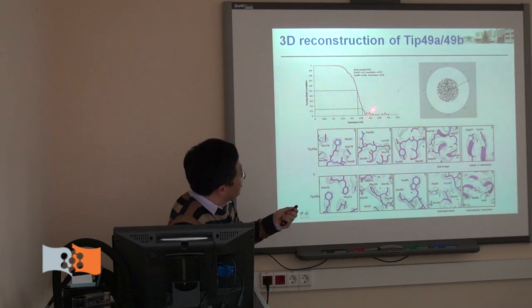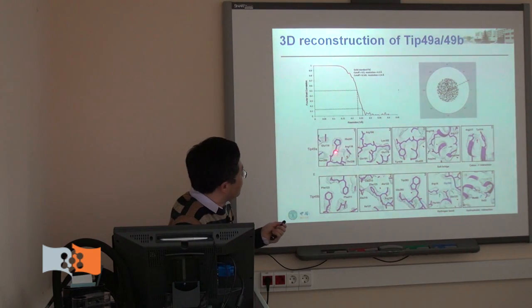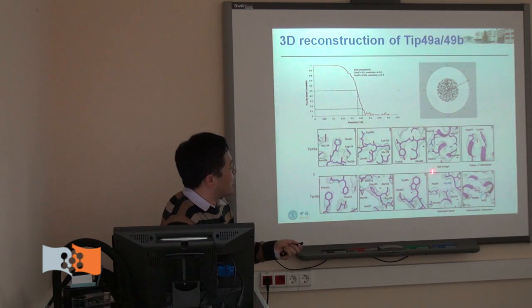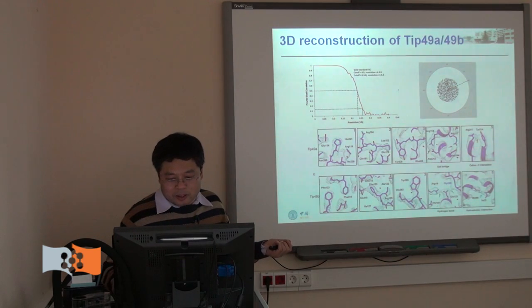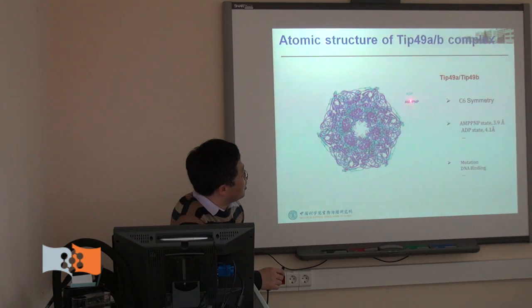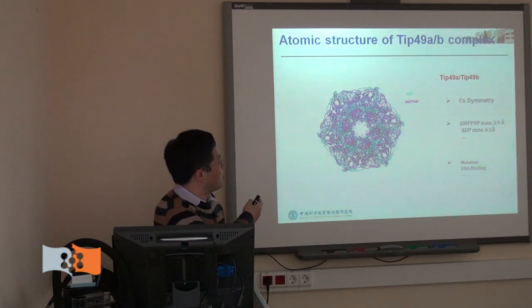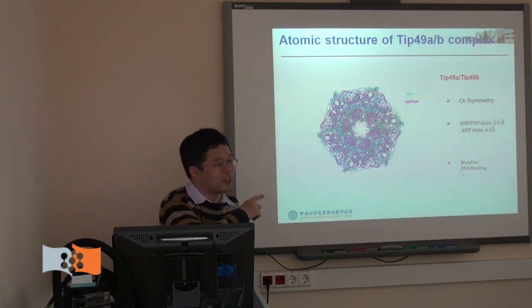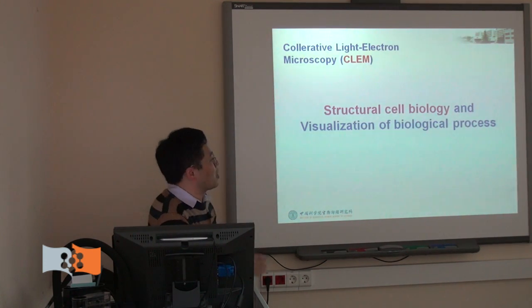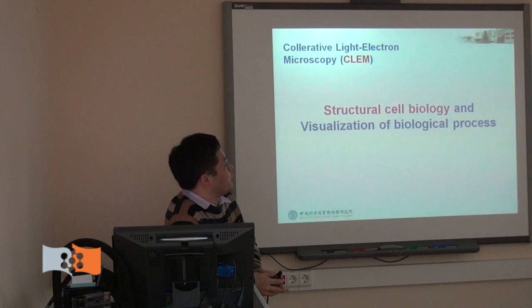This gives us around 3 angstrom, actually better than this one. This is old data. So we now get 3.6 angstrom of this complex. You can see the side chains here, or even some connections between side chains, the interactions. This is a very good reconstruction. Basically we got the ATP and ADP binding states. We are still wrapping up this story and trying to make a manuscript. So that's several examples from my lab: viruses, chromatin remodeling complexes.